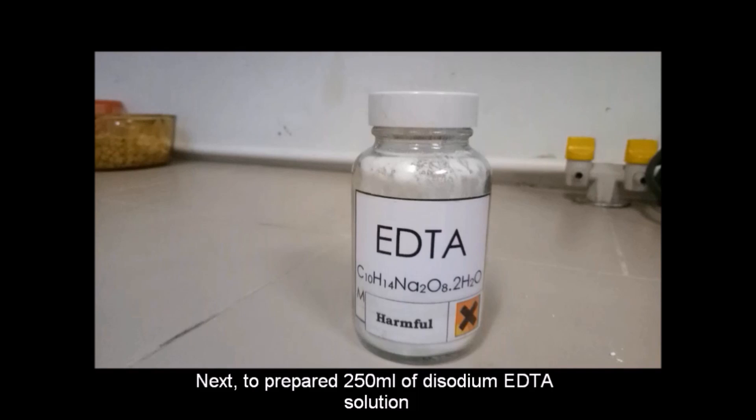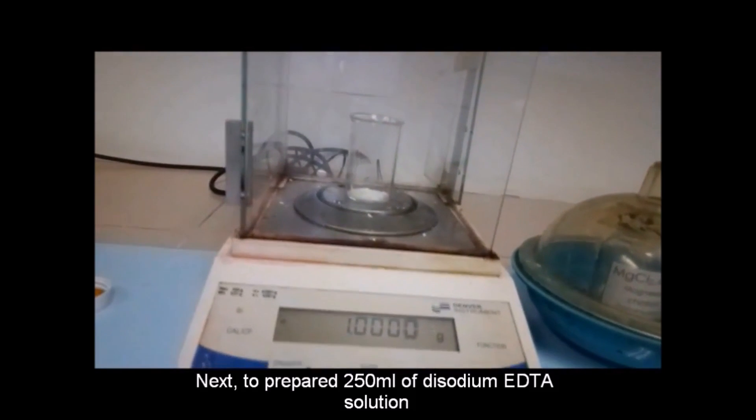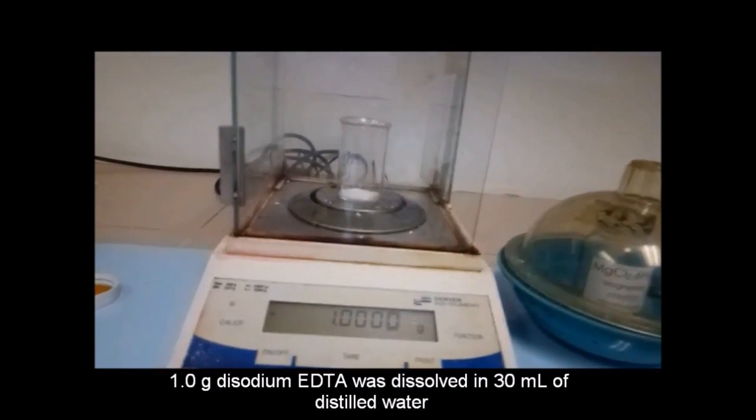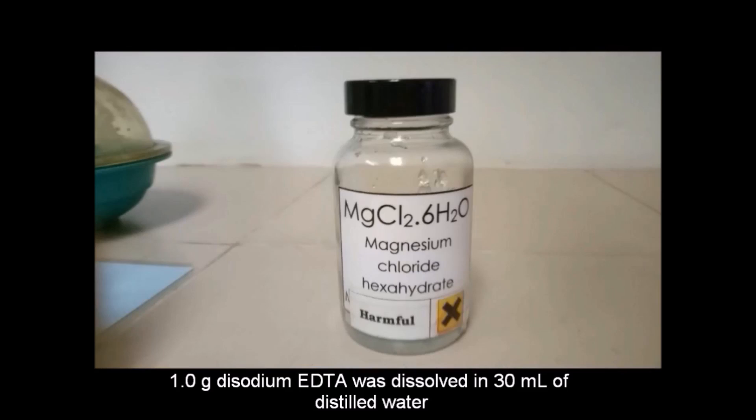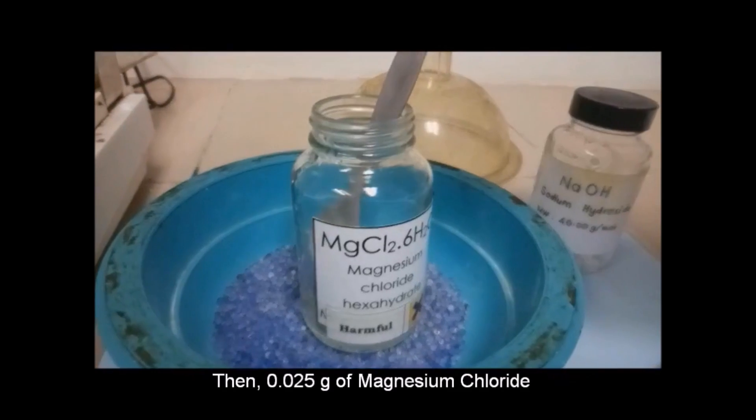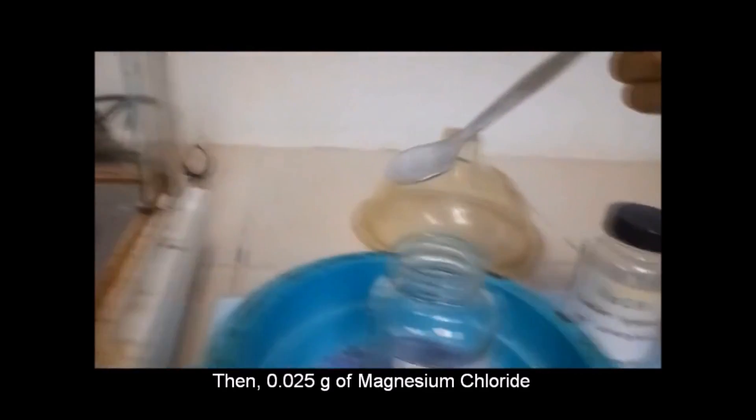Next, to prepare 250 ml of disodium EDTA solution, 1 g of disodium EDTA was dissolved in 30 ml of distilled water, then 0.025 g of magnesium chloride was added.